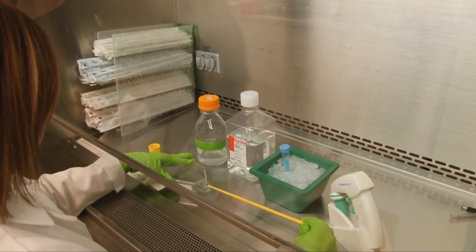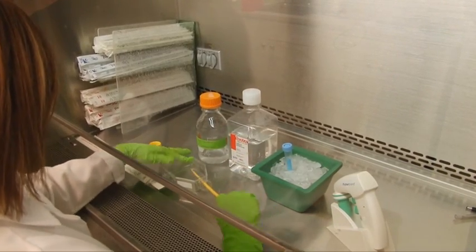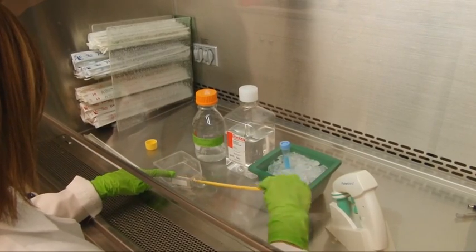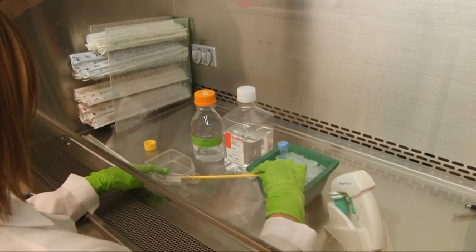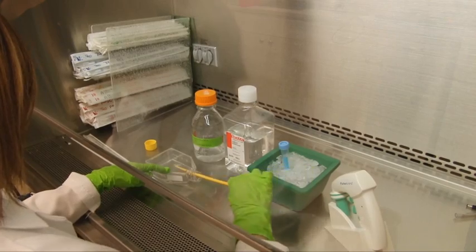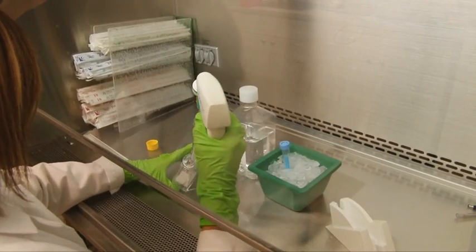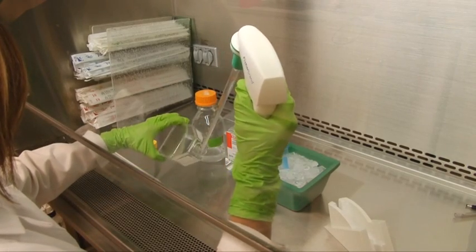In order to solubilize membrane-bound proteins, we will require stronger extraction detergents compared to isolating cytoplasmic proteins. In this example, we are using a standard RIPA buffer, which is a common buffer for obtaining maximum protein yield while extracting proteins from all cellular localizations.